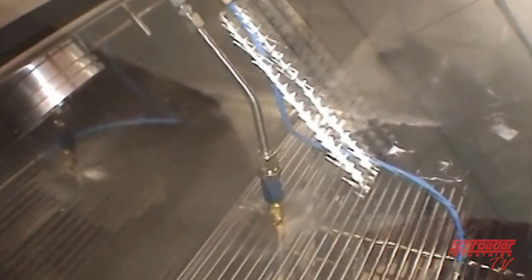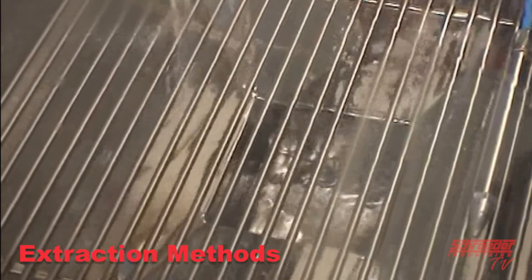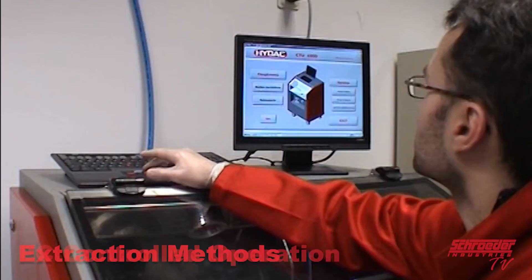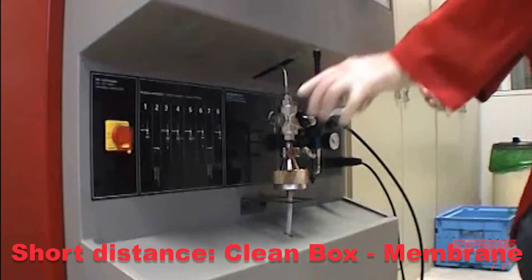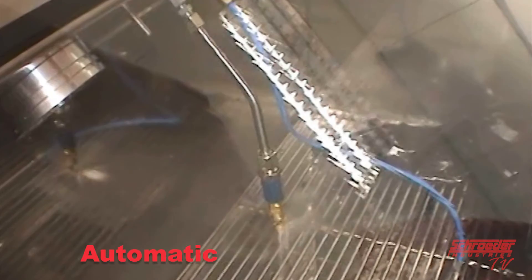Several advantages of the Schroeder CTU are: a compact clean box which provides low negative blank values; ultrasonic extraction methods, which is optional for loosening up dirt and rinsing; PC-controlled operation that is programmable and optimized for each part; short vertical distance to membrane which ensures all dirt is captured; three spray methods — manual, automatic, and self-cleaning; and the CTU is also foot operated for safety.